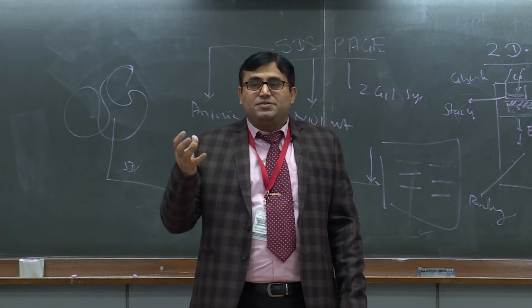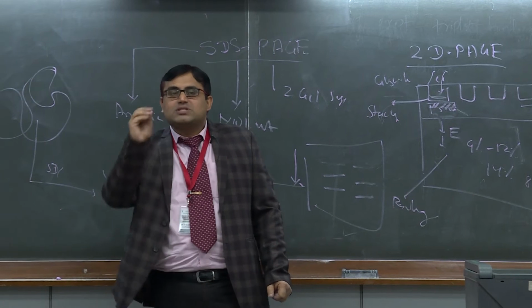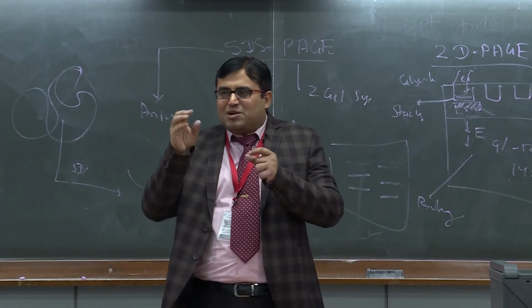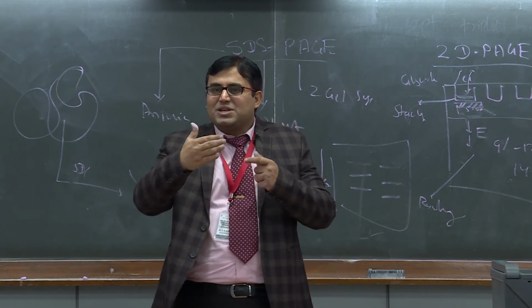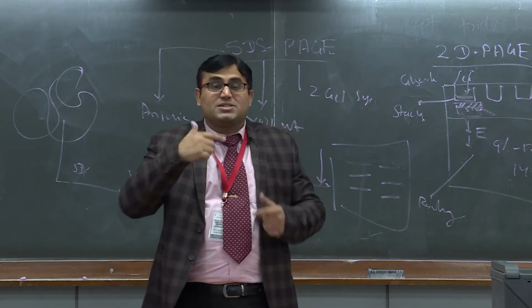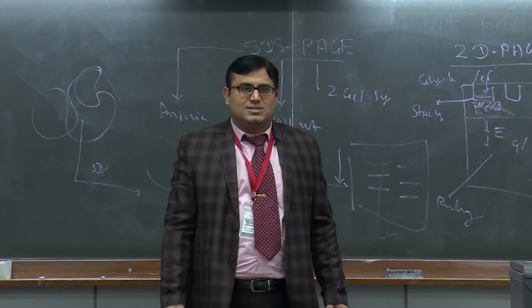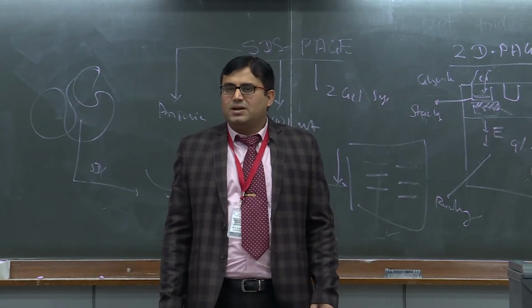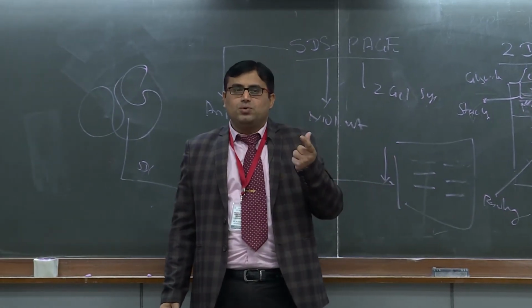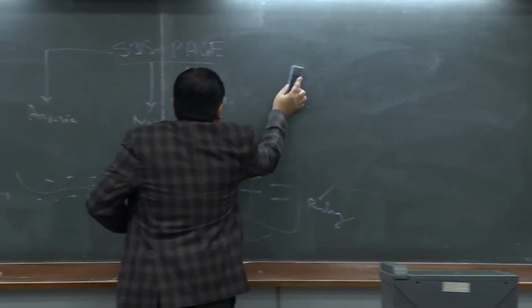Since the gel which you have used has a very high concentration of polyacrylamide, the pore size is small, so now the sieving effect will start. Sieving means the pores will filter the protein, and based on its size and molecular weight it will start moving. It is because of this reason that you are getting protein bands at different locations. Now a few precautionary measures which you should know before executing the SDS PAGE.